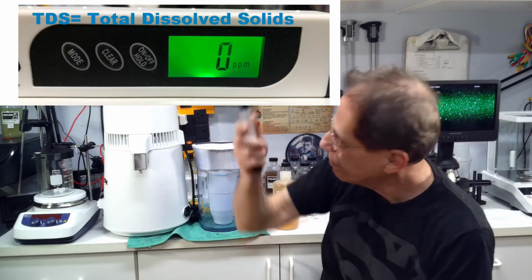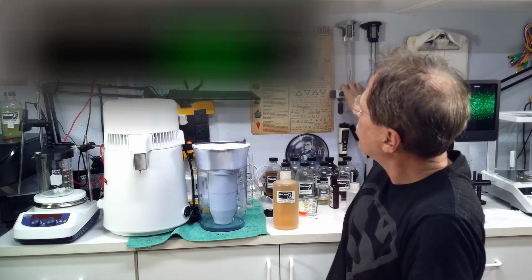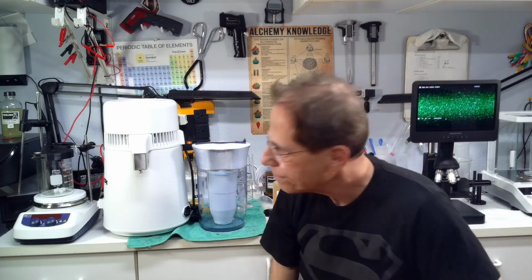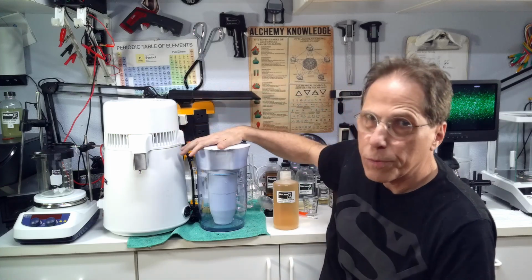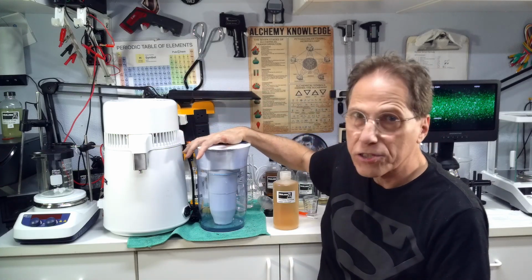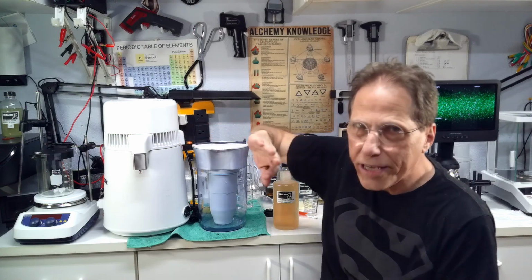This is a TDS meter. You stick it in the water and it'll tell you. My previous video goes into more detail than that. If you want to watch me measure the various waters, I'll link to that video. So this does produce 0 parts per million water through filtration. I actually find that amazing. And it does work with colloidals. Again, with gold, it was a little hinky on the gold. The gold knew that this was filtered water and not distilled water. So take that with a grain of salt if you're trying it with gold.